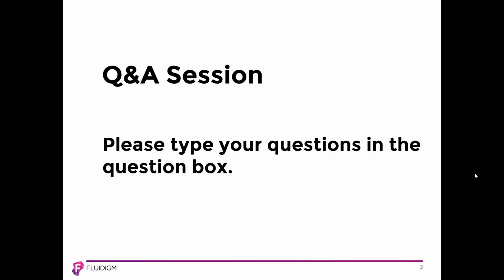Thank you, Anita. Another question came in for IMC, and it's saying, should we cluster analyses per sample or cluster analysis of all samples together to identify subgroups of cells?